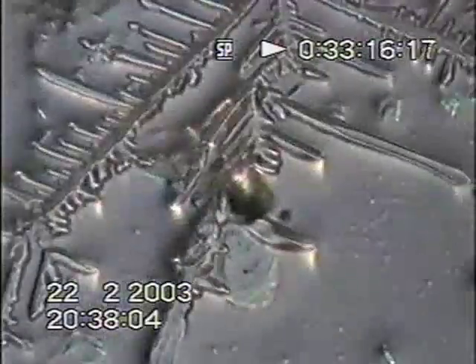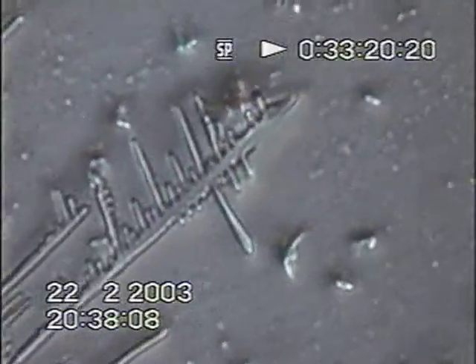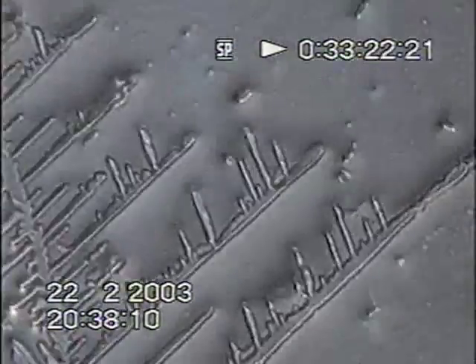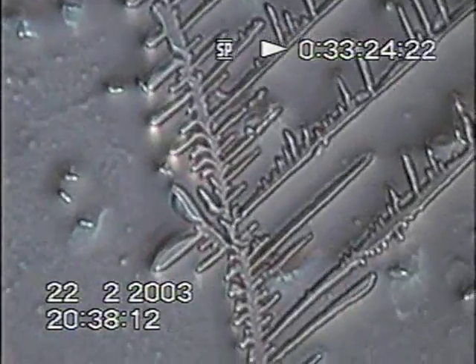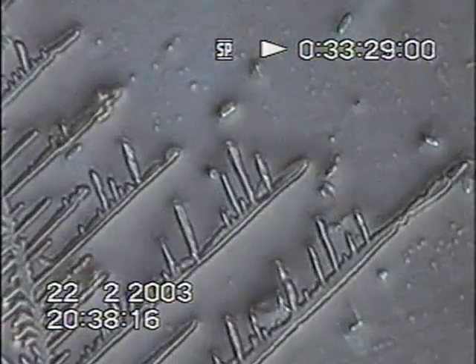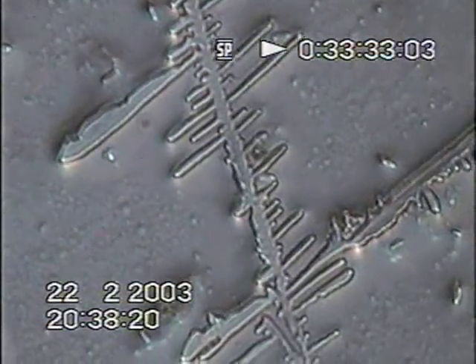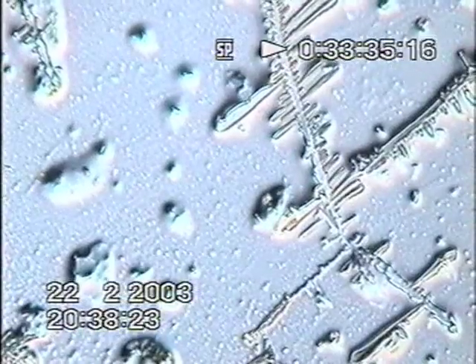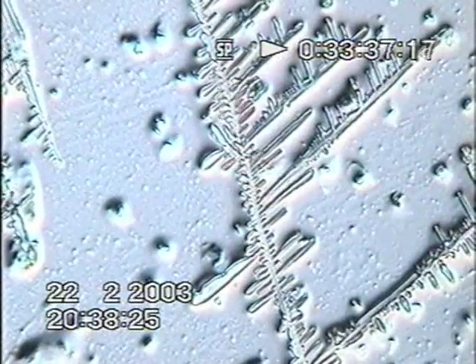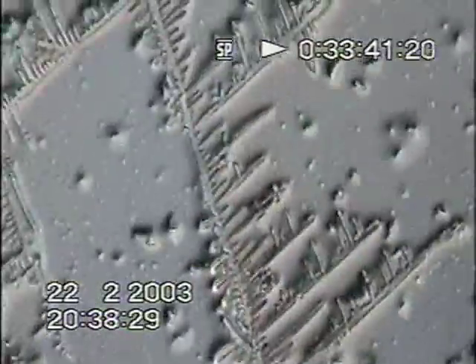Here are some really big ones. This drop was taken off the slide after eluting from that slide. I'll put this back on the 10 so that we can see the size of this thing. This is right across the field. It's really big.